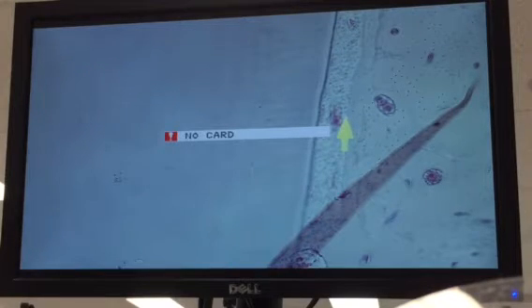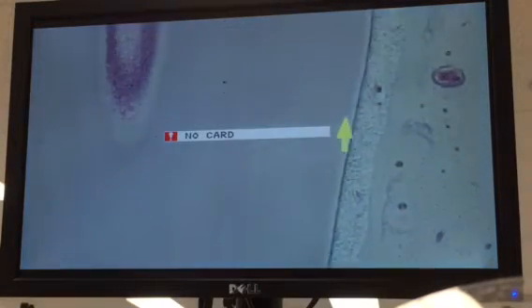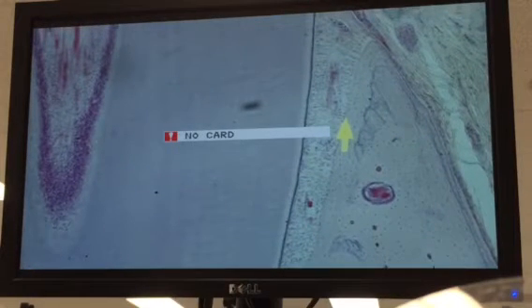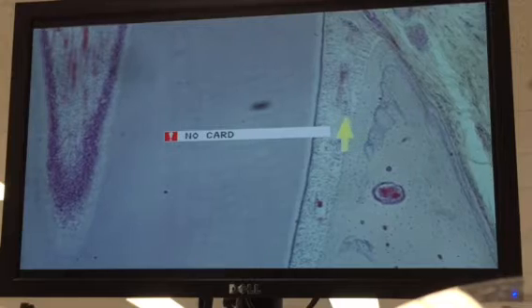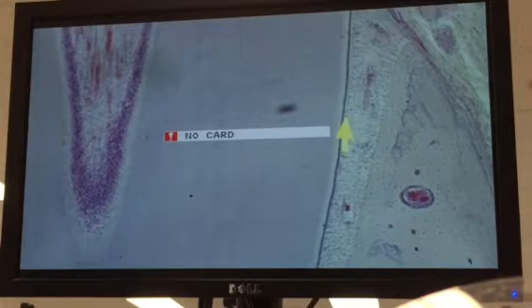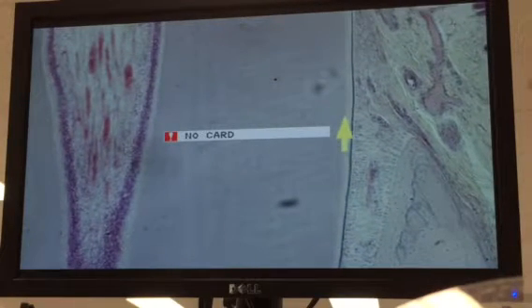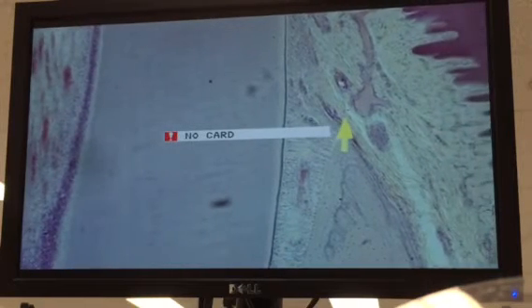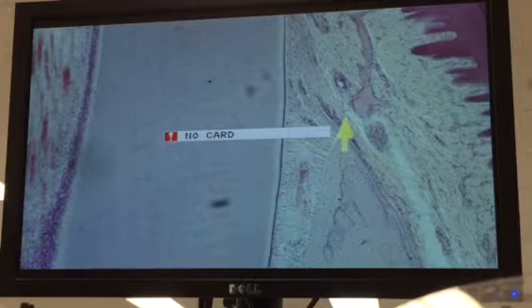The connective tissue immediately surrounding those vessels, or nerves that you might see in the PDL, that is the interstitial tissue. It's loose connective tissue, that's all that it is. And as we go up here a bit, on either side we can see osteoblasts and then cementoblasts and a little bit of interstitial tissue there. And there are those dental periosteal fibers that we'll talk about next week.